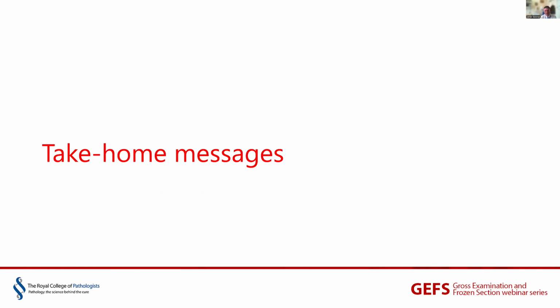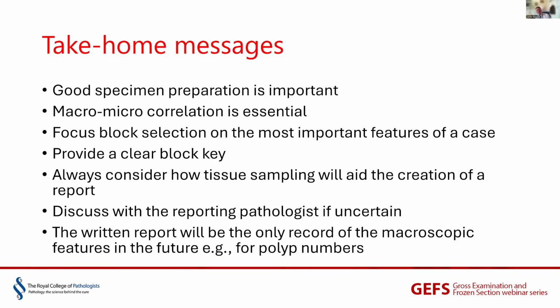Okay, so what are my take-home messages then? Well, first of all, as with any specimen, the preparation is important: the cleaning, the way that you've opened the specimen, the degree of fixation that you give it as well. All of that's very important.